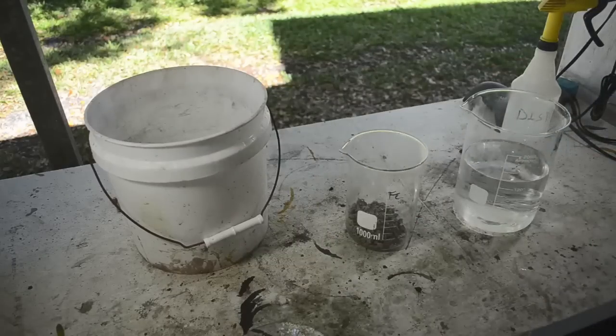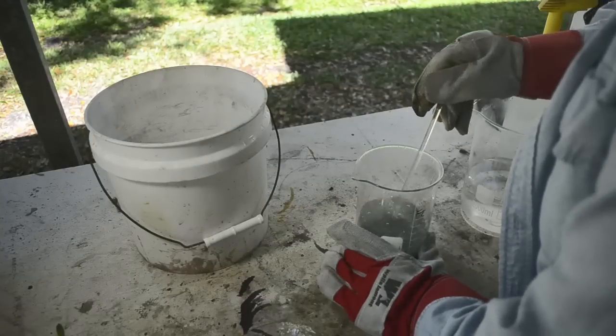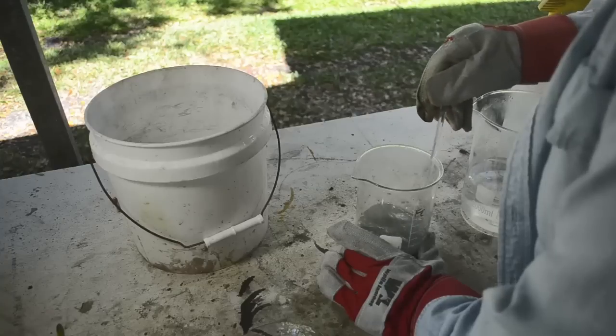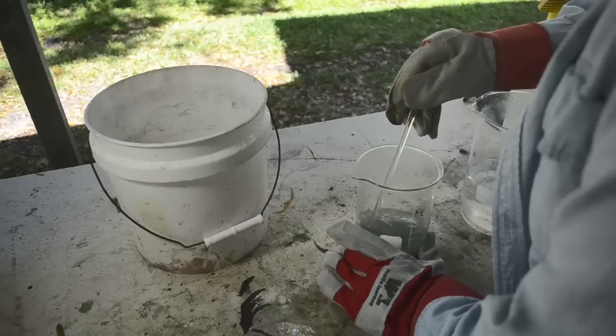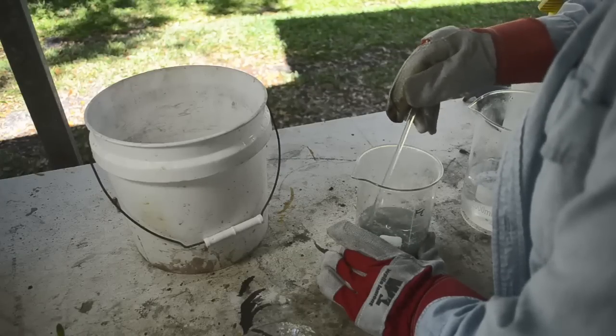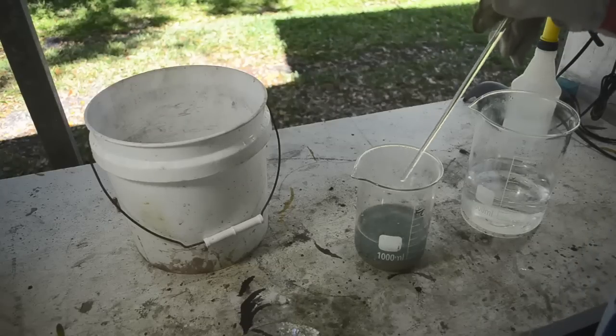So I'll be back once I think it's pretty clean. Well, we're a couple rinses in. We're not quite done yet. What I've noticed is that the silver is in big clumps in here. So I'm breaking up the clumps, because I'll bet there's a lot of copper nitrate hiding inside those clumps. You can see the liquid is still a little bit blue.